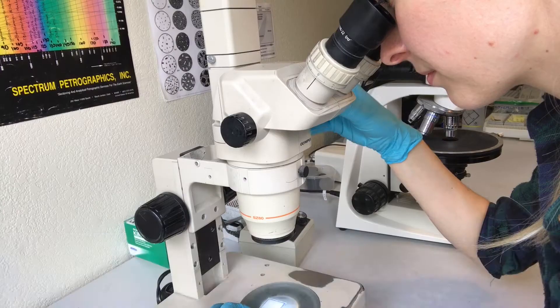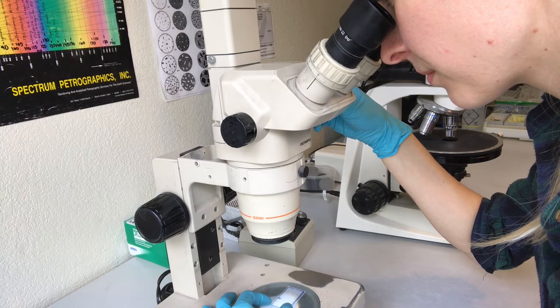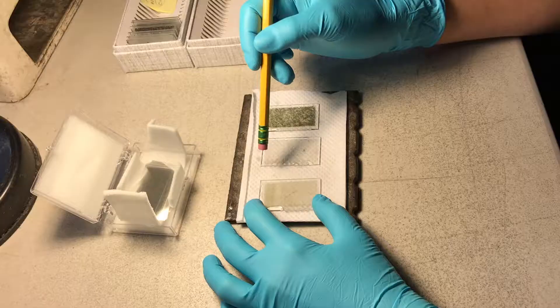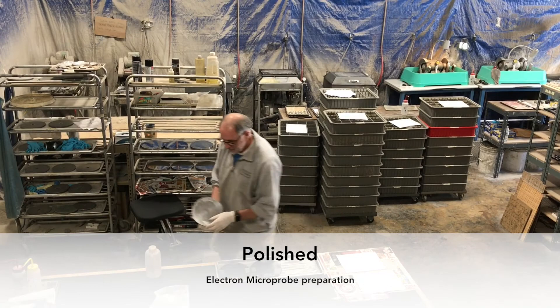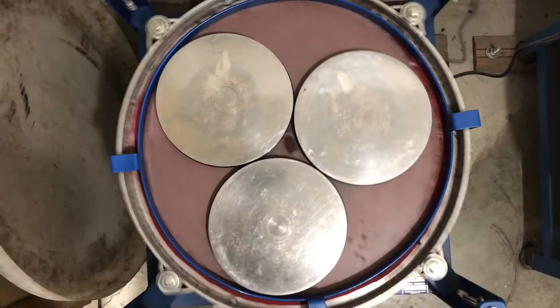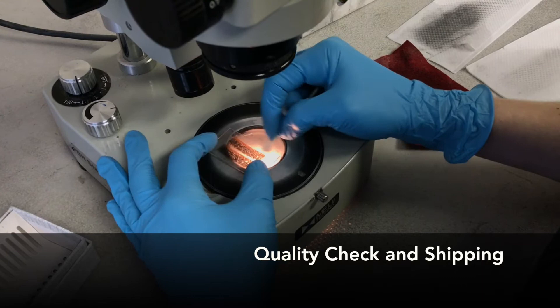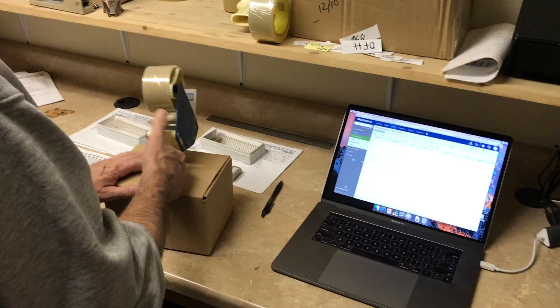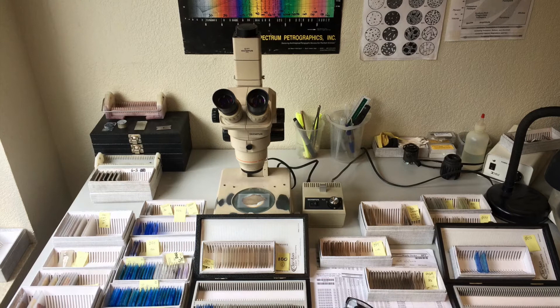The most important finishing distinction is whether a slide is unpolished or polished. A traditional petrographic section is our most basic preparation — left unpolished, it is suitable for transmitted light analysis using an optical microscope. Mineral stains can be applied to the surface, and cover glassing protects the sample and improves optical clarity. Polished thin sections are the most requested preparation and are the platform for most modern microanalysis. After final grinding and cleaning, the slide is polished using 0.5-micron diamond abrasive. After the slide is finished, it is cleaned one last time and checked for quality. Then the sections, billets, and extra sample materials are packaged and shipped off to customers.